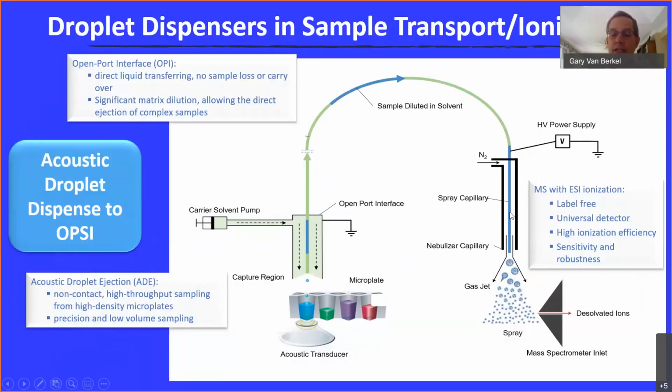Again, you're using an electrospray ionization source, pneumatically assisted for ionization. So we know electrospray very well, so that's a very stable and understood source. There's no fundamental reason that this could not be atmospheric pressure chemical ionization or atmospheric pressure photoionization. The current commercial version, the vendors chose to sell it with electrospray only.